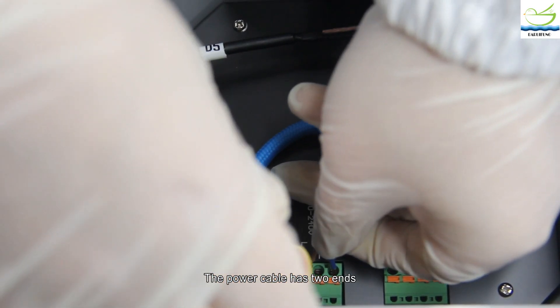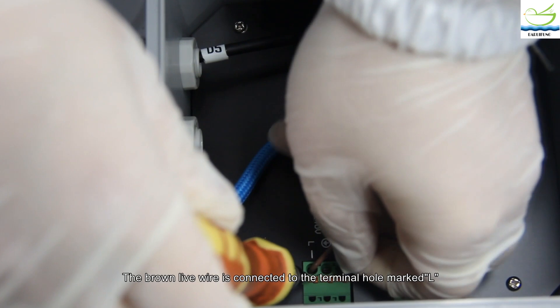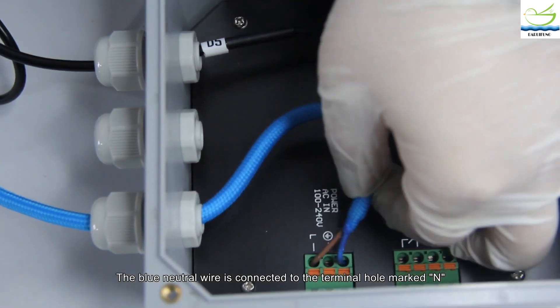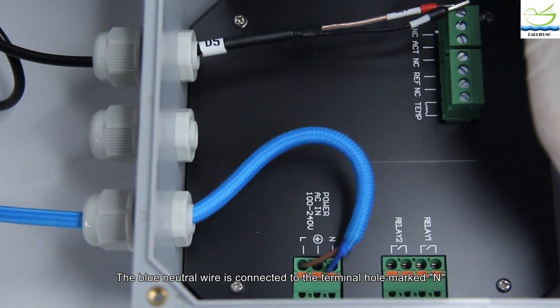The power cable has two ends. The brown live wire is connected to the terminal hole marked L. The blue neutral wire is connected to the terminal hole marked N.